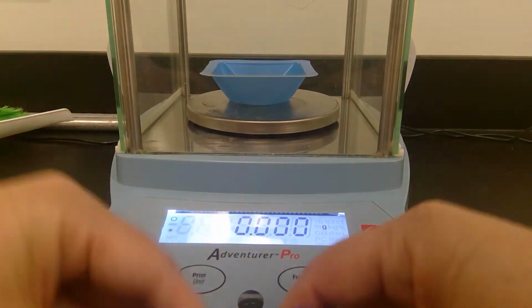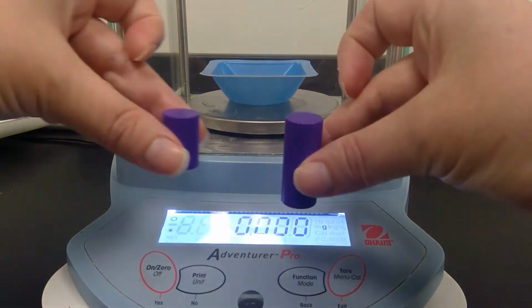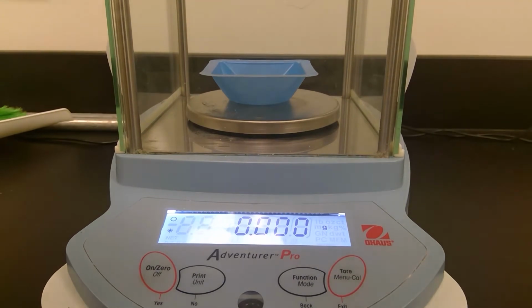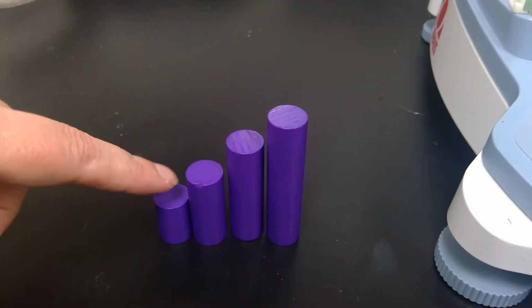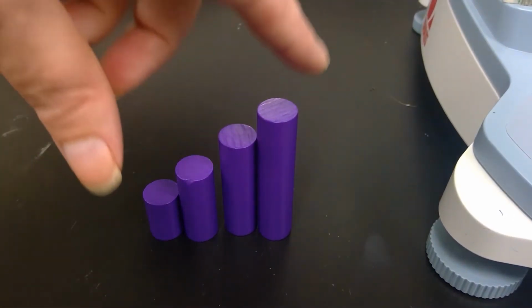They're varying heights, so they'd be different weights. I'll just start with the smallest and work to the largest. So that's what they all look like. And so I'll do the mass of this one, then this one, then this one, then this one.